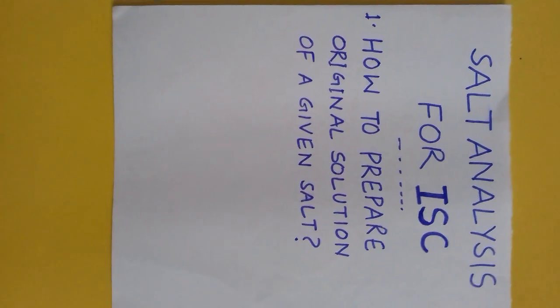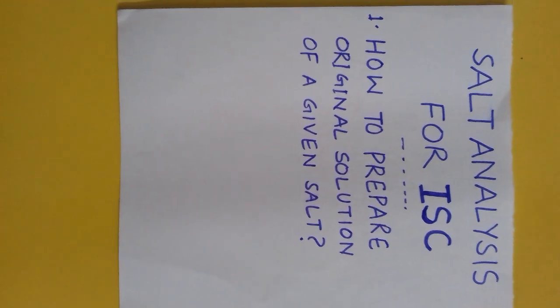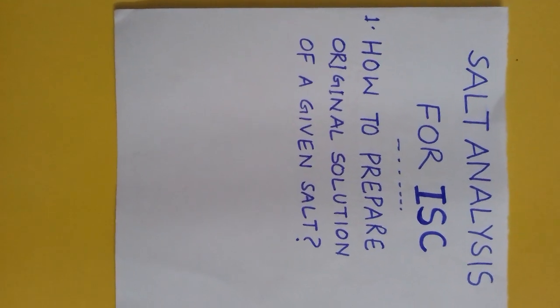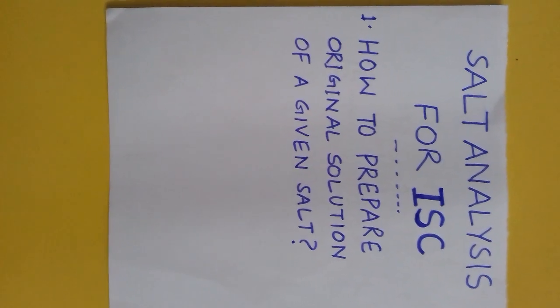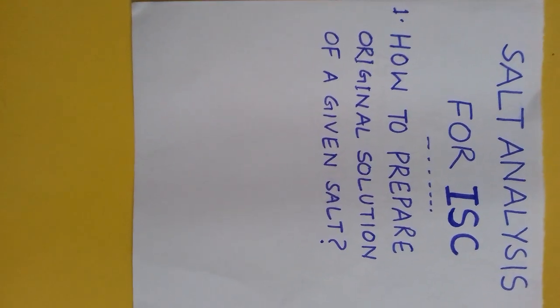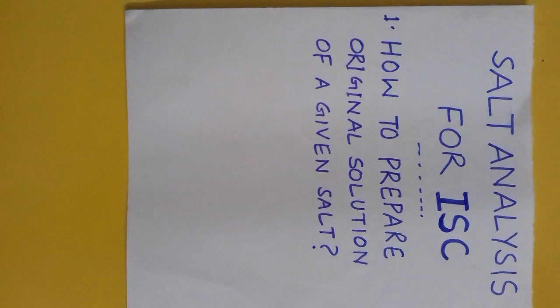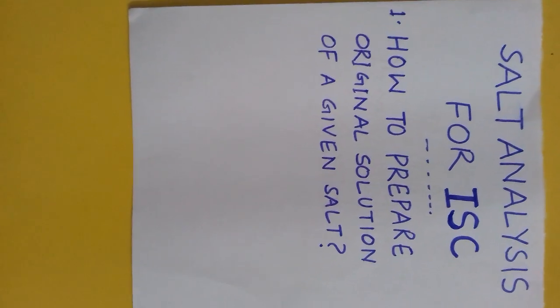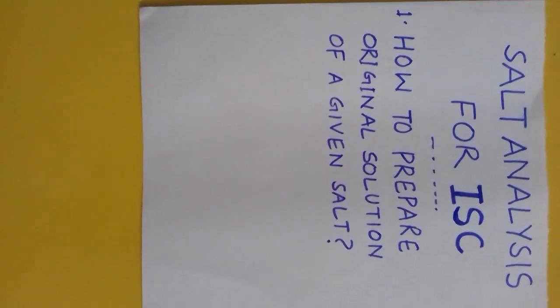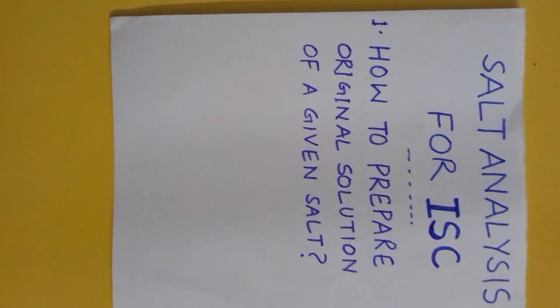A practical in ISC chemistry on salt analysis for those students who face difficulty in preparing original solution. Original solution is the initial step of salt analysis, and I will tell you about how to prepare it easily.